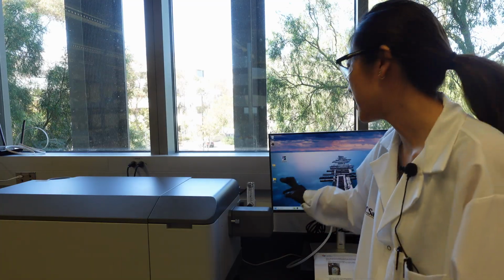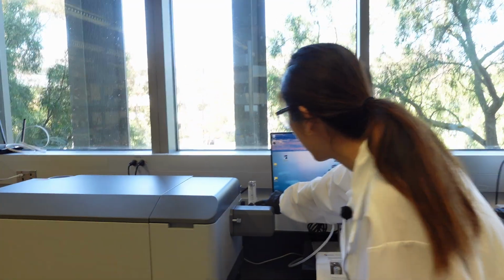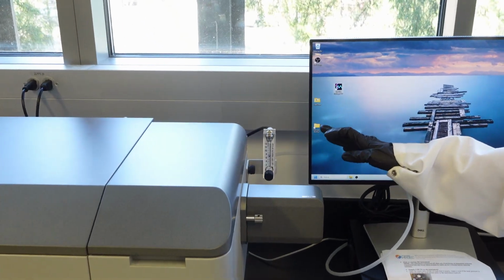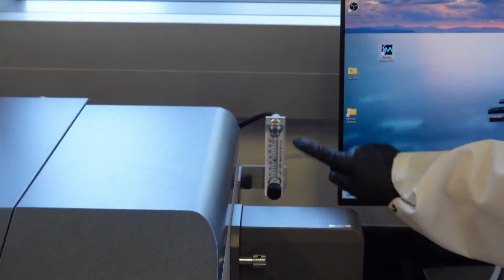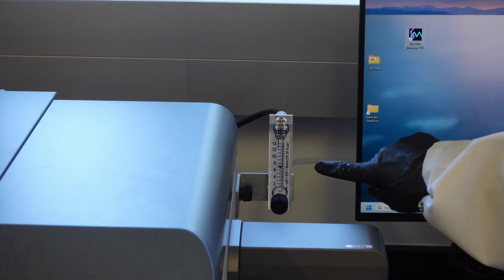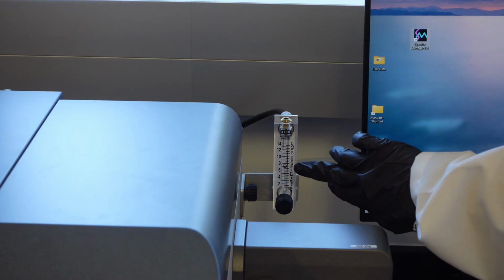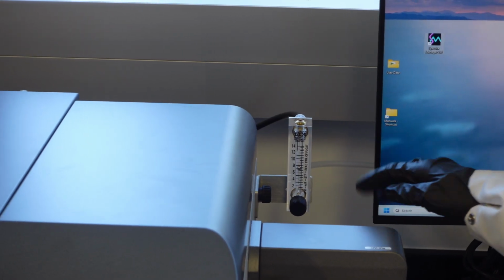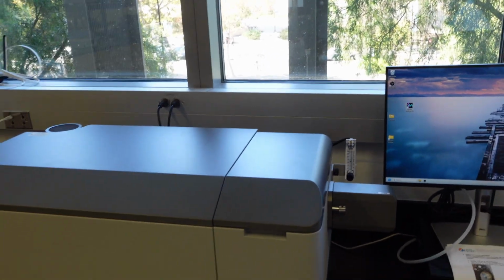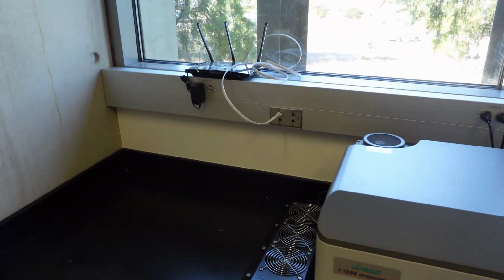So the next thing you want to do is we'll look at this flow monitor. Depending on what measurement you're running, you can reference the SOP for this. You'll spin this dial and just get it to the correct flow rate that you want. So right now we have it at about a 6, which is what we want for our measurements, so feel free to adjust. And then once that looks good, we can go ahead and turn on the instrument.